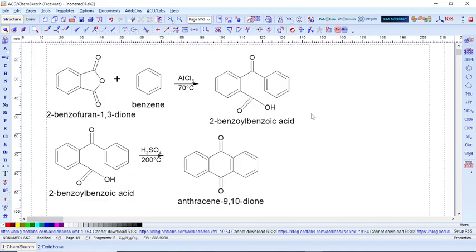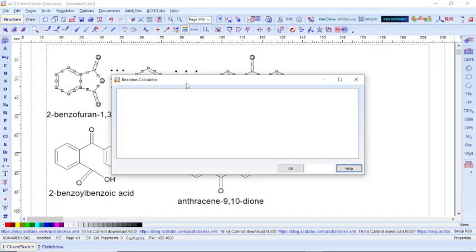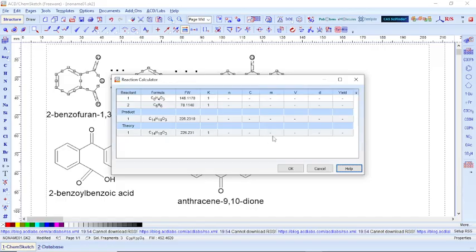So we are avoiding doing manual calculation. I will come back to this point and input what I've done before. For mass, this is 10.865.